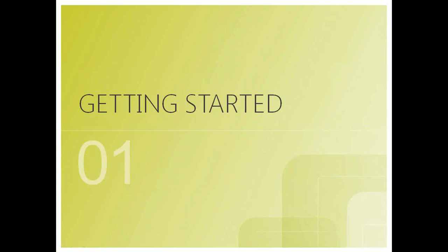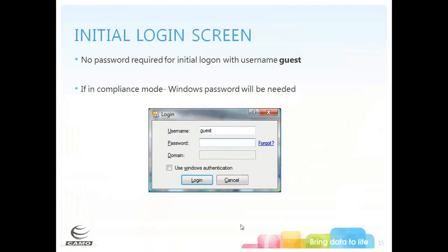The initial login screen when you install the Unscrambler X has a default username of guest, which does not require a password. In the Unscrambler 10.2, it can be installed in compliance mode, in which case your Windows password will be needed. Once logged in, you can change your password and username, which will then be associated with the audit trail carried with your projects.